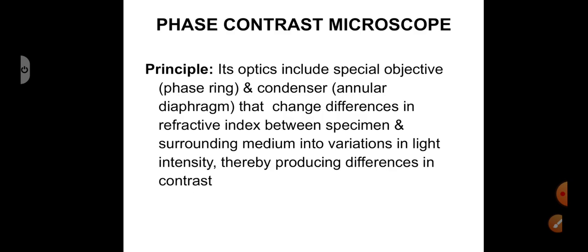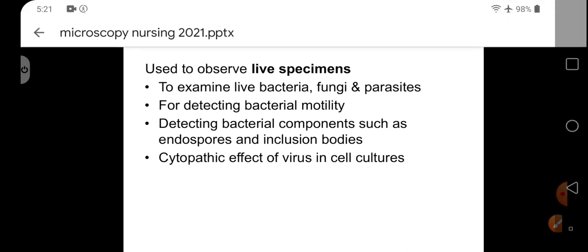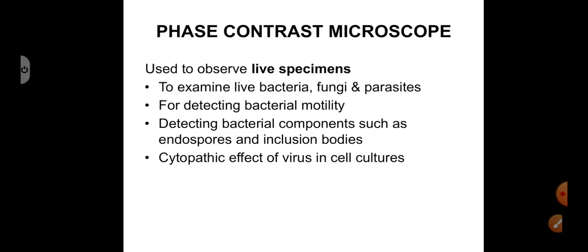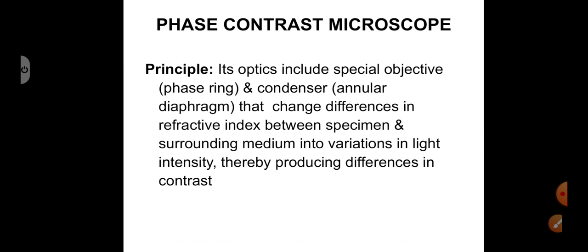Now let us move on to phase contrast microscope.